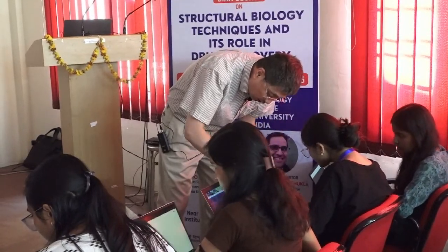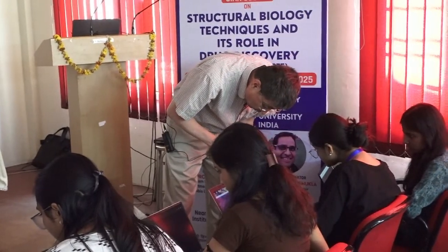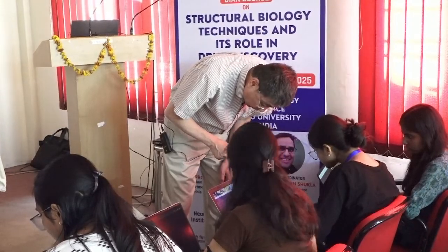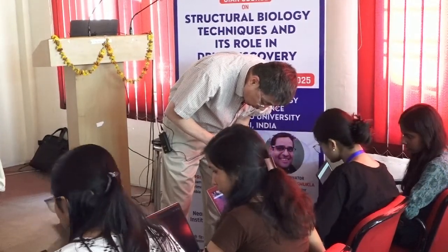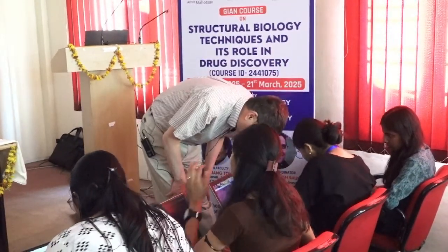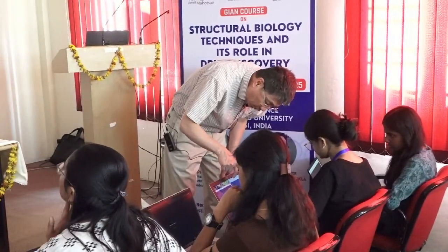See, now you're variant 2 now, right? Which residue is that? This one is the arginine. Which residue number? I can't see. This is 45. Arginine. Okay, 45. That's not it.